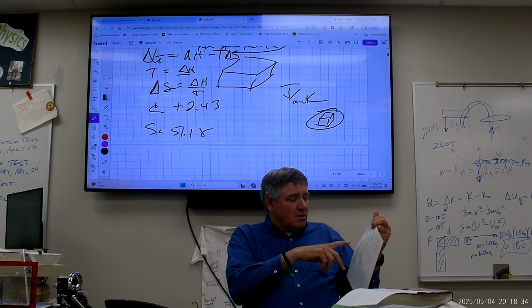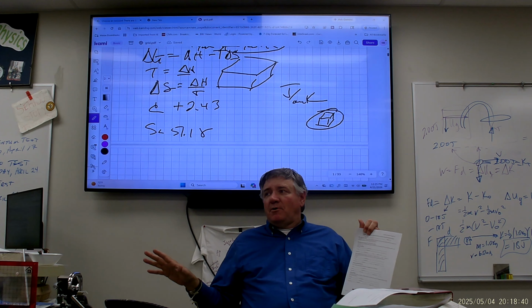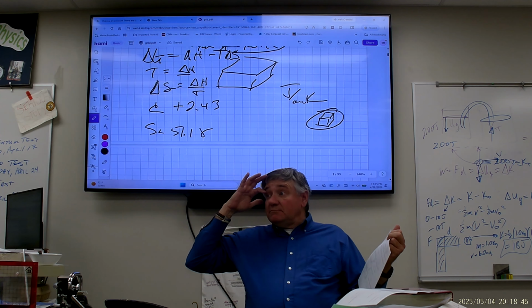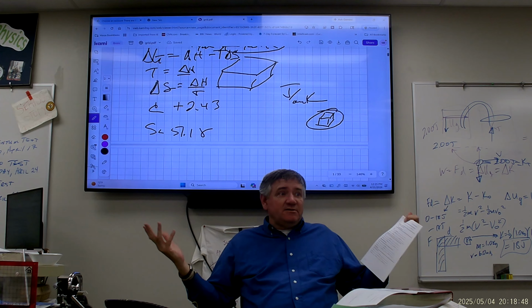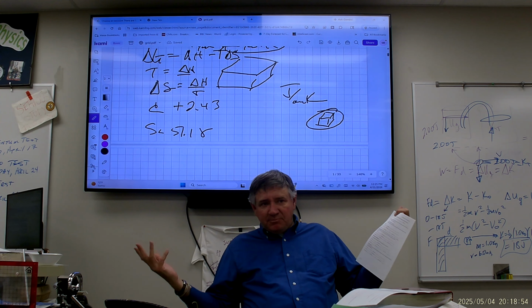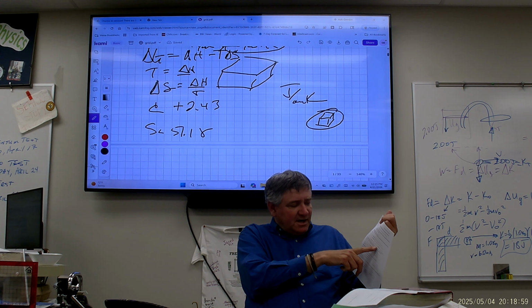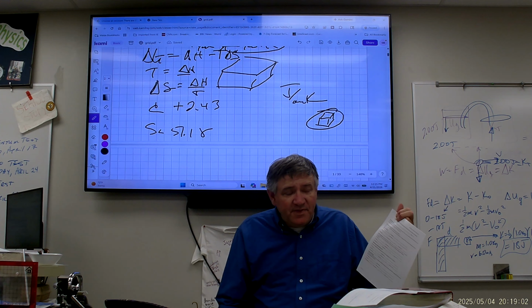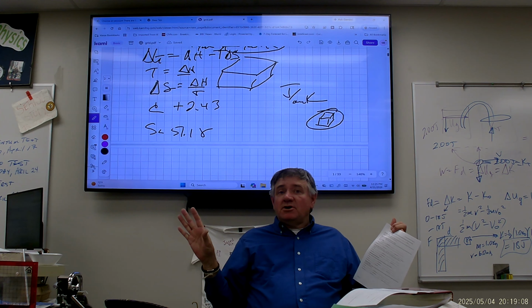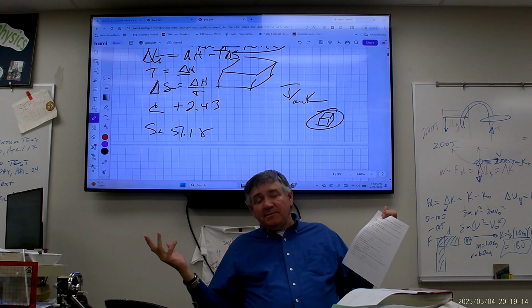Okay? So this is based upon your observations. There's no math at this point. Just based upon pure observations. You're going to predict, hey, what's the sign of delta G? What's your justification for it? Positive or negative? What's the sign of delta S? Positive or negative? Based upon observation. Then you're going to record the initial temperature, the final temperature, and we're going to calculate the change in temperature for the surroundings. And then you're just going to have the sign of delta H. You're not going to calculate it. You're just going to say, here's my delta H, I think that's going to be positive or negative.